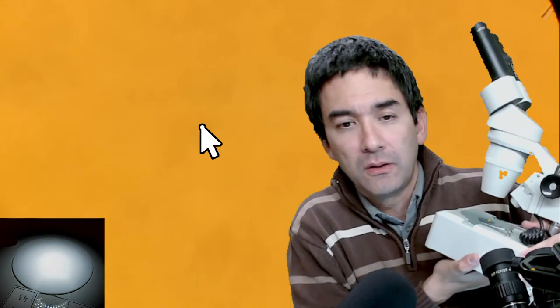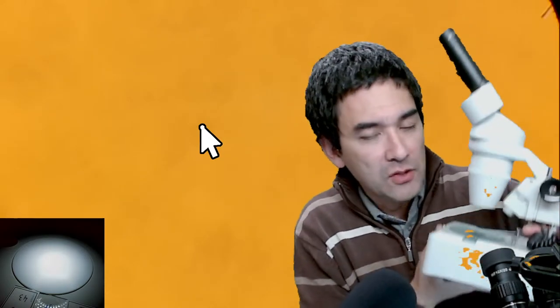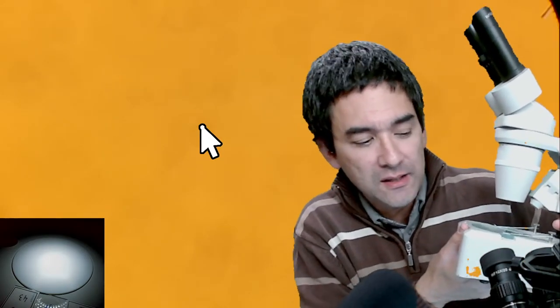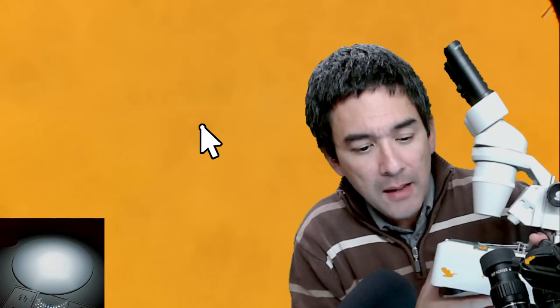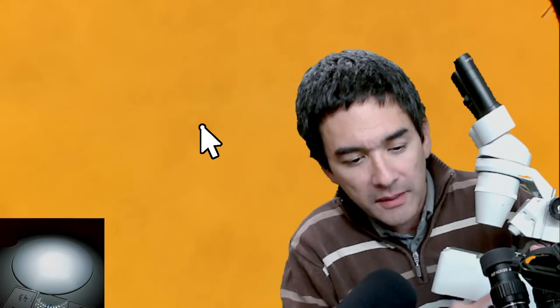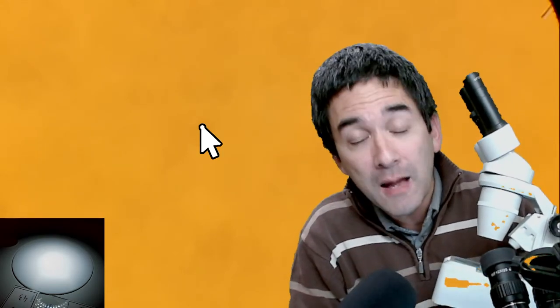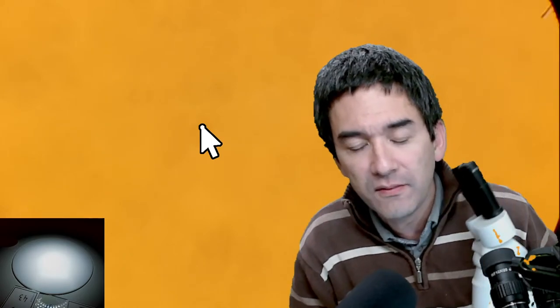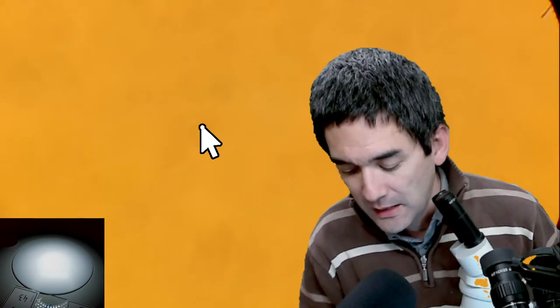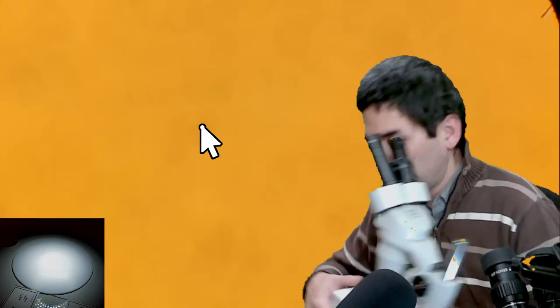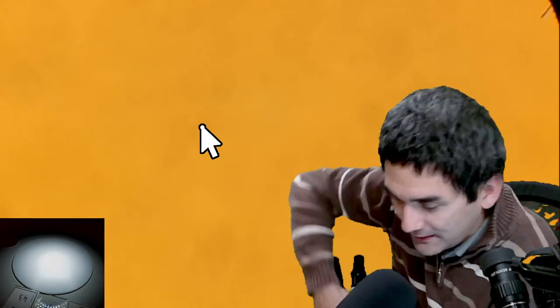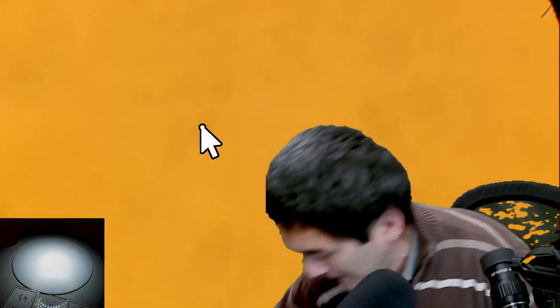The advantage of stereo microscopes is that you do not need to look at transparent objects — this is the focus of today's video. Let me put this microscope back down on the floor.